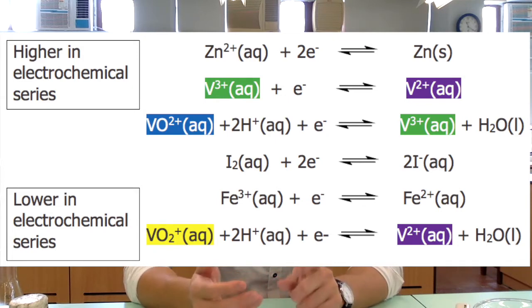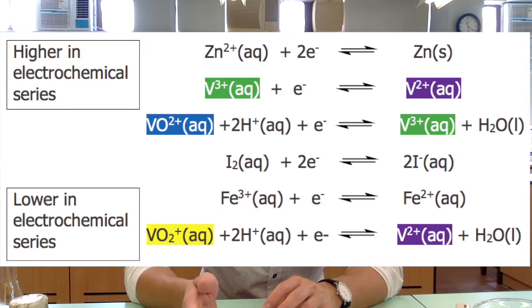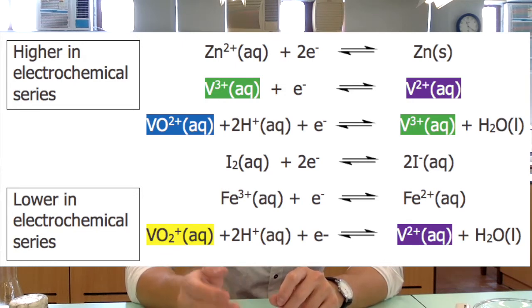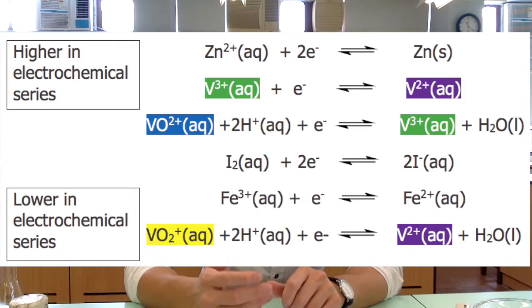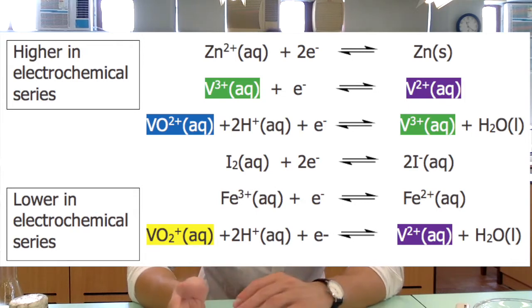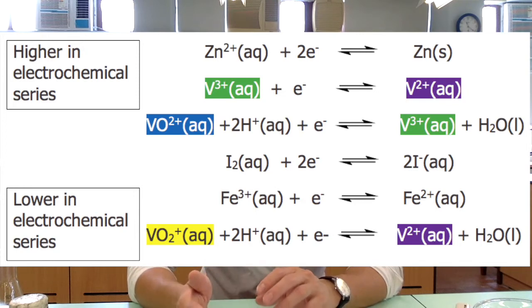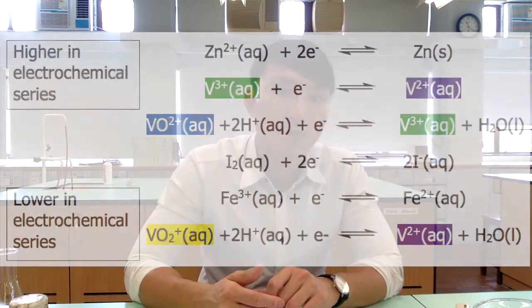When we react zinc with dioxo-vanadium(5) ion, you would expect the reaction to produce V2+ as the final product. However, if we carefully adjust the quantity of zinc added, it is possible to reduce the dioxo-vanadium(5) ion in a step-wise manner — first into oxo-vanadium(4), then vanadium(3), and lastly vanadium(2) — observing the color of each species.